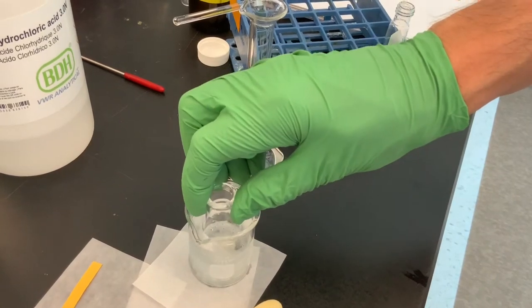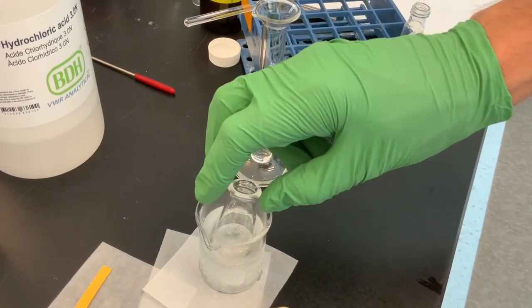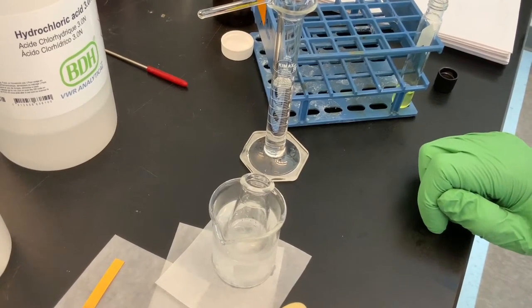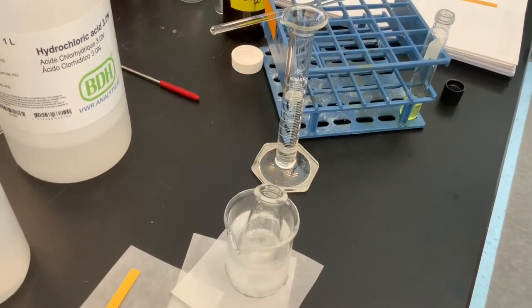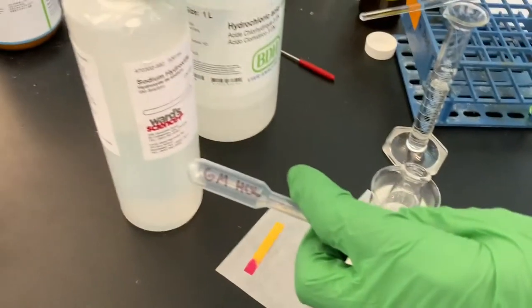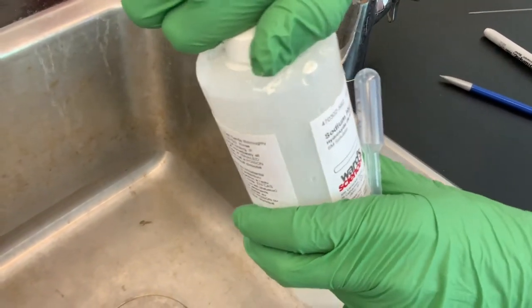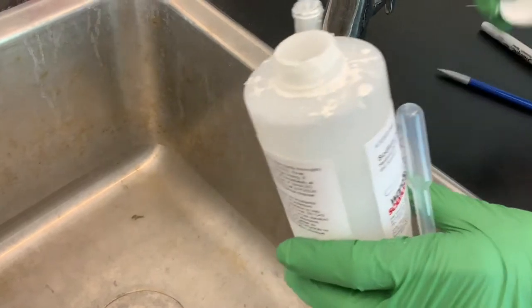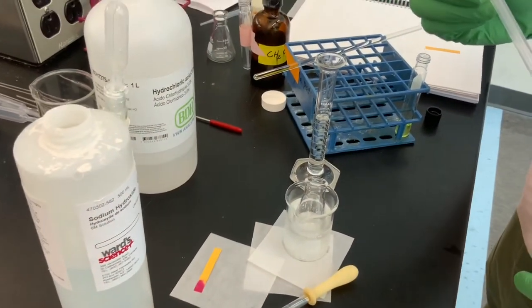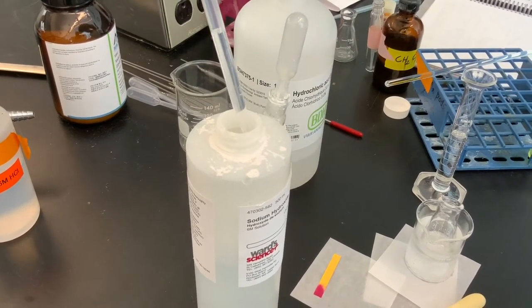Now I'm placing my 10 milliliter Erlenmeyer flask into an ice water bath, and at this point, I want my benzocaine back. I don't want it as the water-soluble salt anymore. I want it as the free base, okay? So what I'm going to do now is use sodium hydroxide in order to do that. And here I've got the bottle of it. This is a 6 molar solution of sodium hydroxide. Let me open this over the sink because someone has spilled some on top and it's evaporated, and so that's all sodium hydroxide. I changed my glove, remind me. And so we're going to add 2 milliliters of this sodium hydroxide. So that was about spot on.